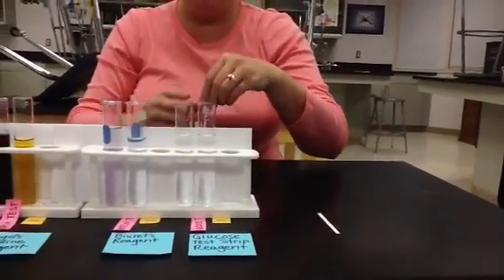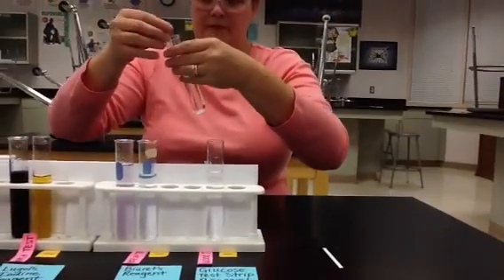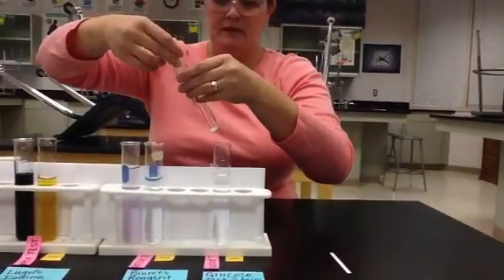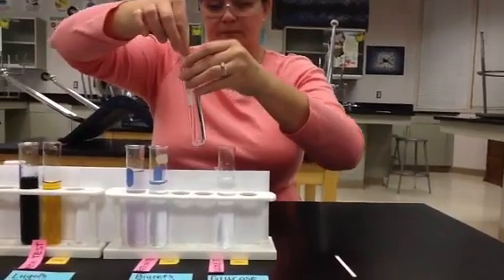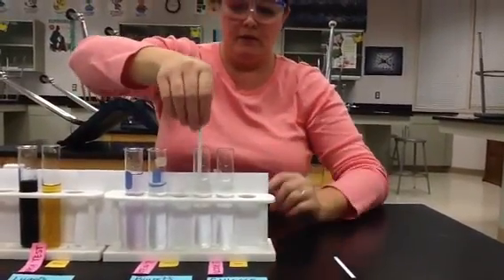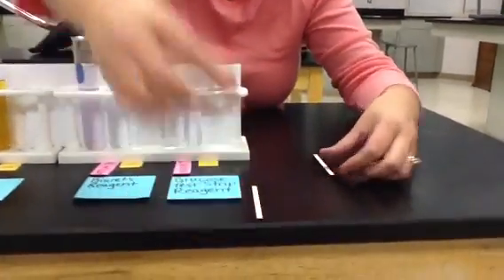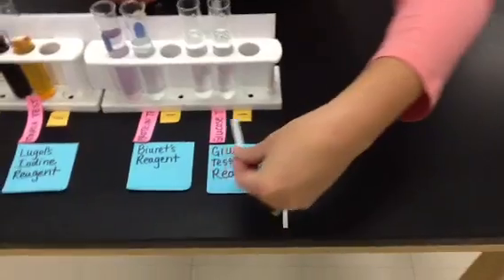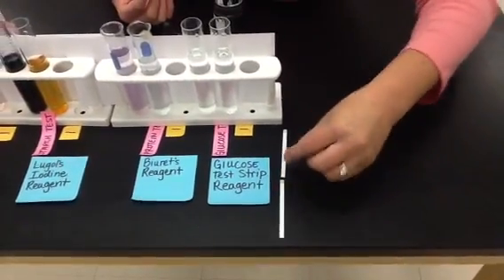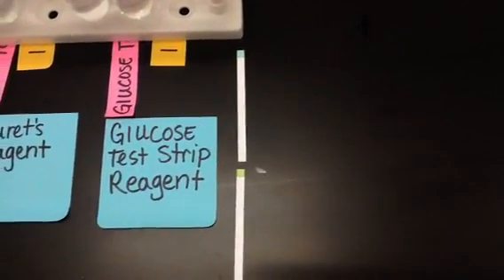And then I'm going to do one for our glucose. And sometimes these take a little bit to turn. So you're going to see the difference here in a positive test and our negative test. Let's put our negative test up here. So you'll see that it turned a green. So anything beyond that blue color is considered a positive test.